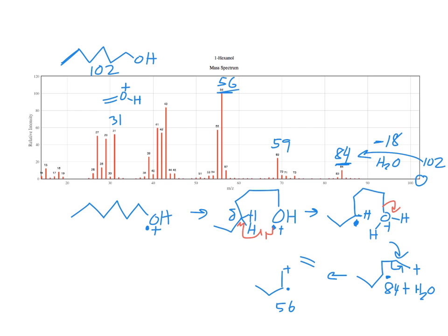And the reason for choosing delta instead of gamma is, I think, because to reach around, 6-member transition states are a good size of a ring, right? And so that's oftentimes the favored ring size to transfer an atom like that.